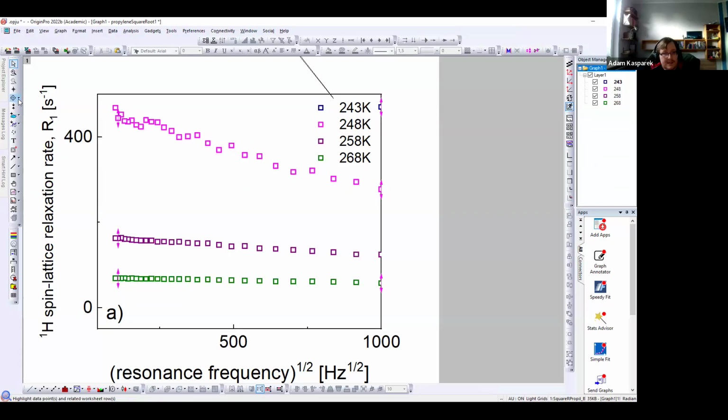Okay, we have such a result, and frankly, in this entire region, this data set is more or less linear. It's not perfect linearity, because we can see that something here is maybe experimental error or something else happening, but it's more or less linear.